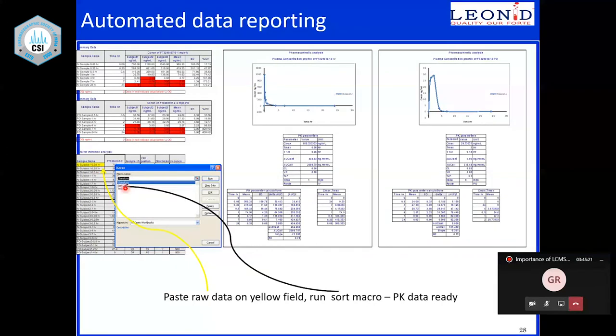This profile will directly go into the feedback loop to our animal study people. It will give the information of Cmax, Tmax, Thalf, whatever is coming. Based on the concentration achieved here and the time it remains in the body, they will design the molecule further. Then, I was telling you, molecules will undergo metabolism also. If you want to analyze the unknown metabolite, when we do the analysis, see, my parent molecule was 207.